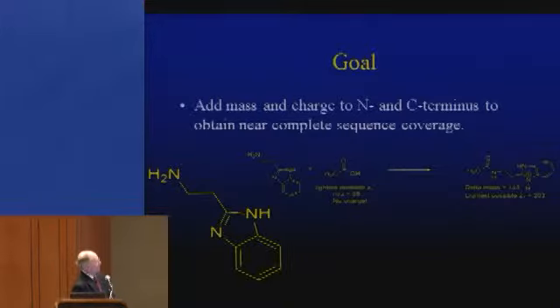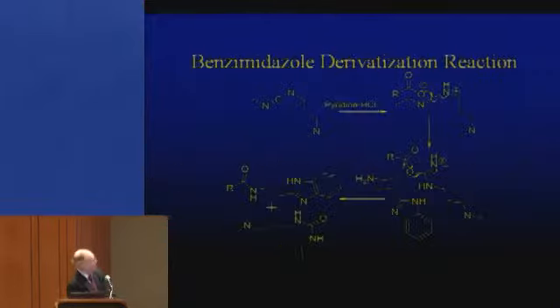And note that this is glycine with a hydrogen as its side chain. Its mass is 59. If I could put a proton on it, it would be 60. But I can't put a proton on it because there's nothing basic. Now I can over here, and since what I've added weighs 143, the mass of glycine is going to jump to 203 because I've made the mass heavier and I've given it a charge so I could detect it in the mass spectrometer. So the chemistry is this.